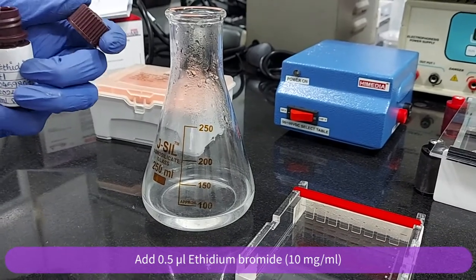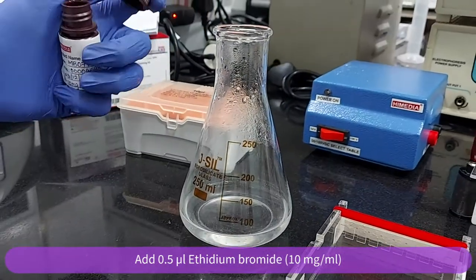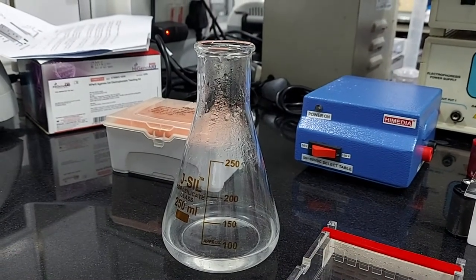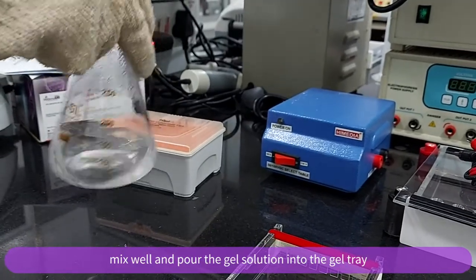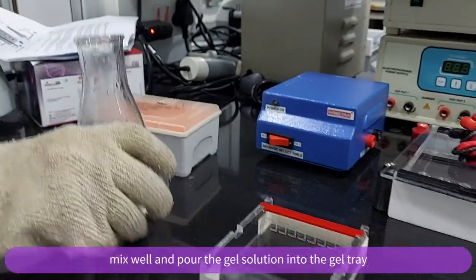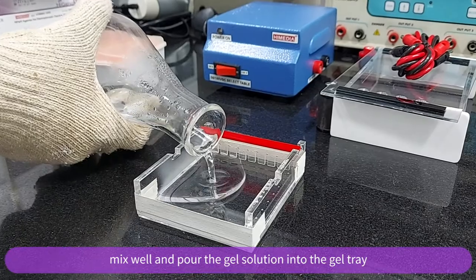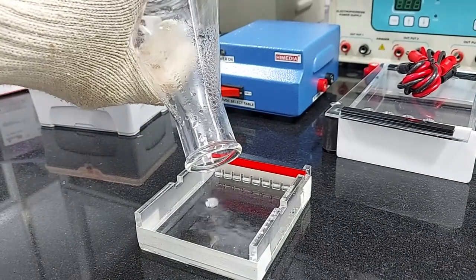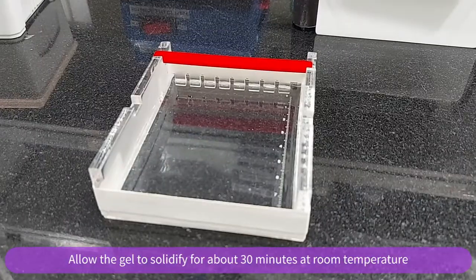Add 0.5 microliter of ethidium bromide. Mix well and pour the gel solution into the gel tray. Allow the gel to solidify for about 30 minutes at room temperature.